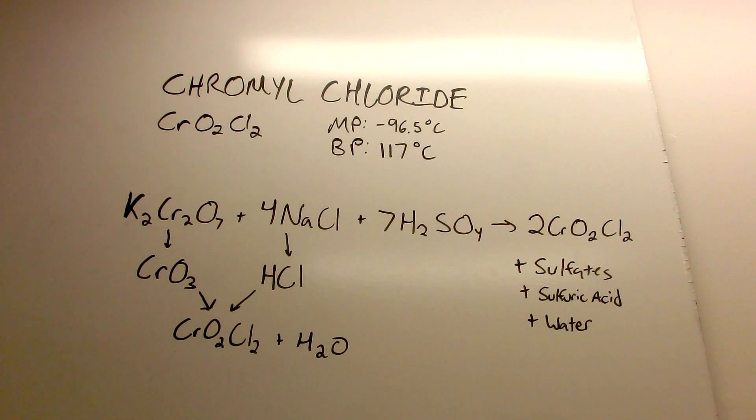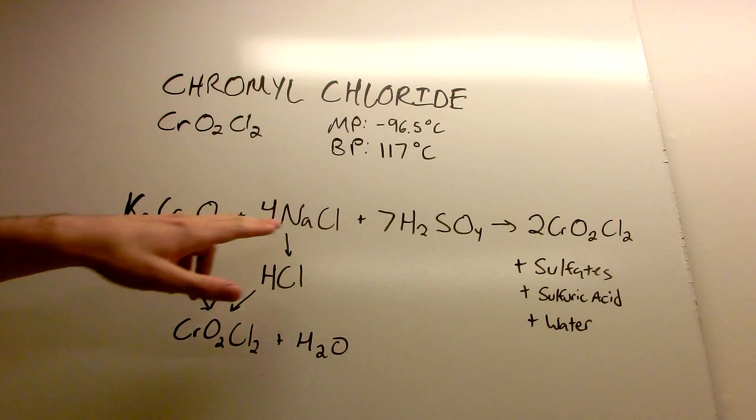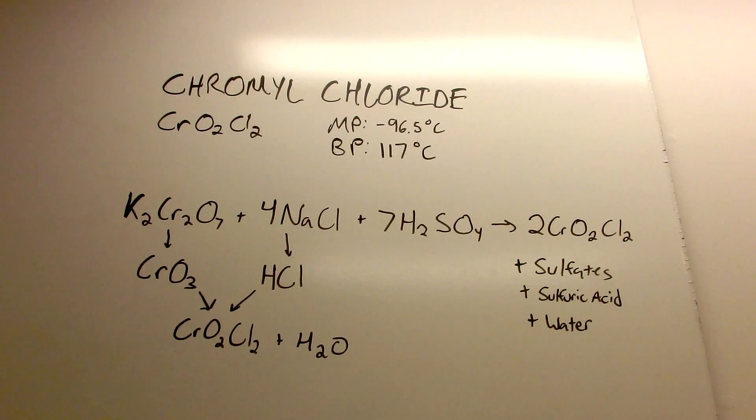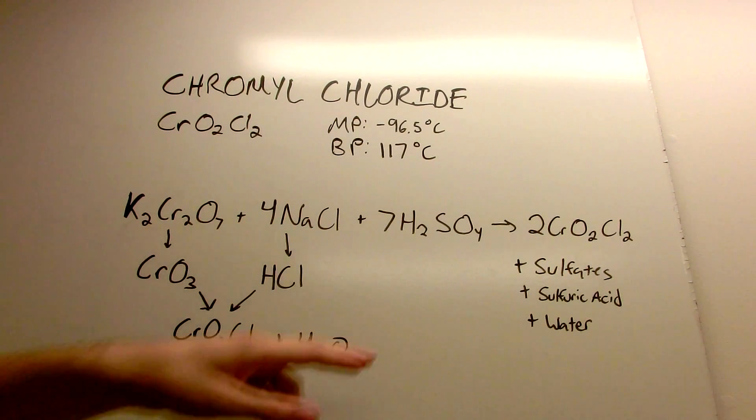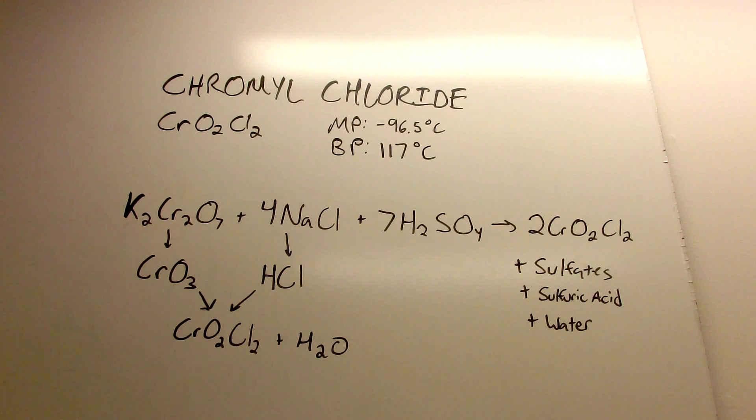Today the chromal chloride is going to be made from potassium dichromate, sodium chloride, and sulfuric acid. That's going to yield our chromal chloride plus some sulfates, excess sulfuric acid, and some water.